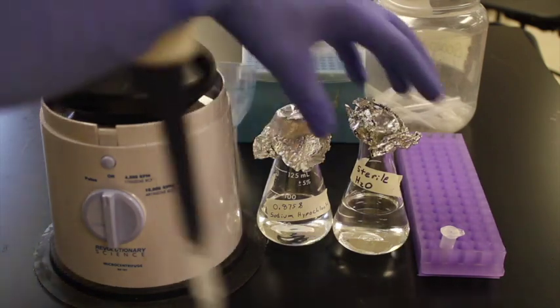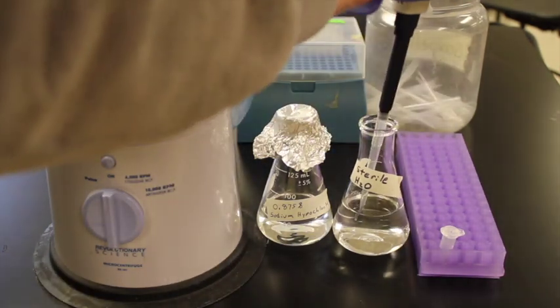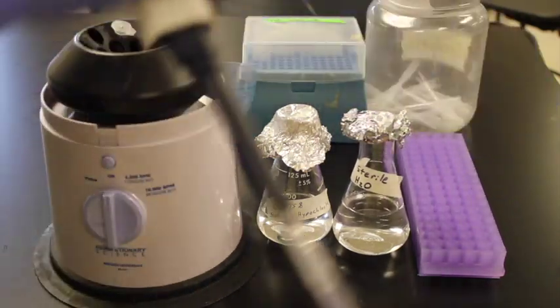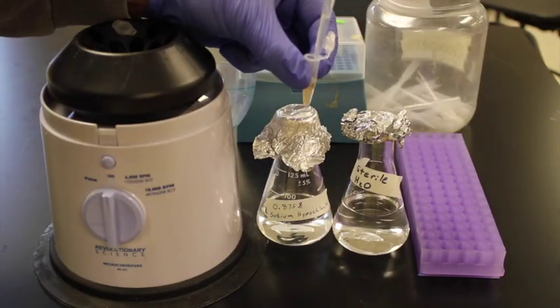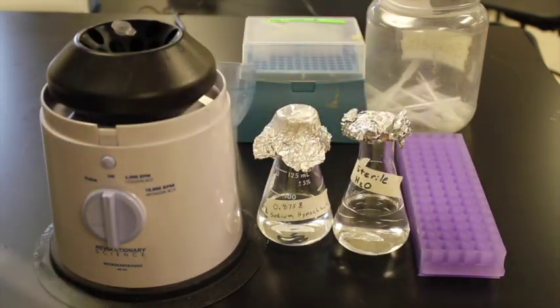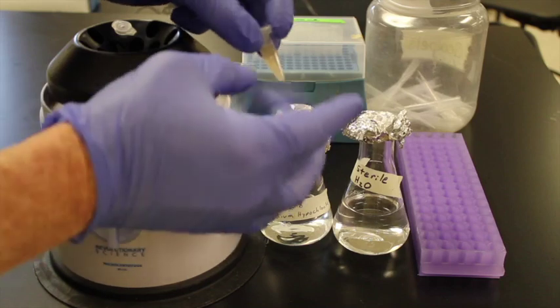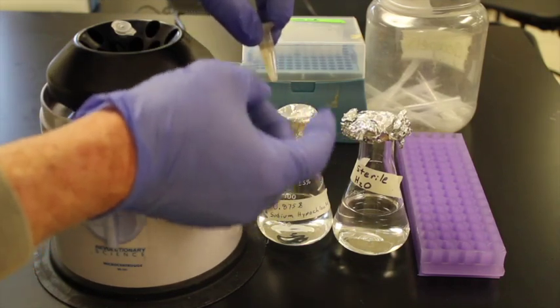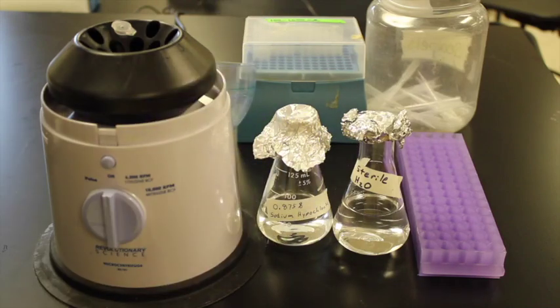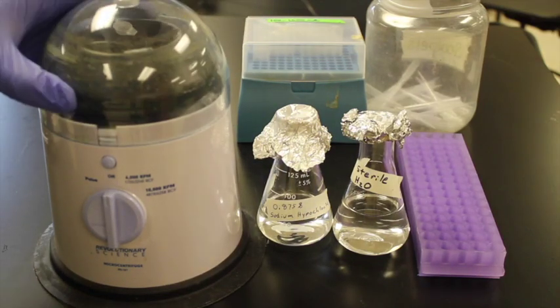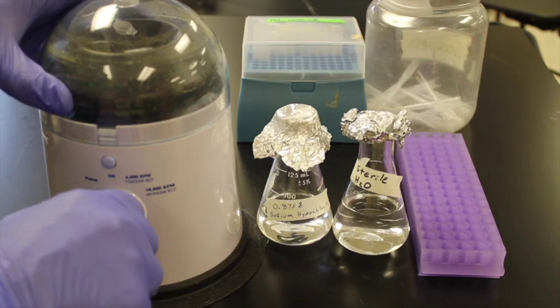Then I will change my tip again. Get some sterile water. Place the sterile water in the microcentrifuge tube. And we'll kind of mix it around a little bit to allow the water to get rid of that. I'll throw it into the centrifuge. We'll centrifuge it again.